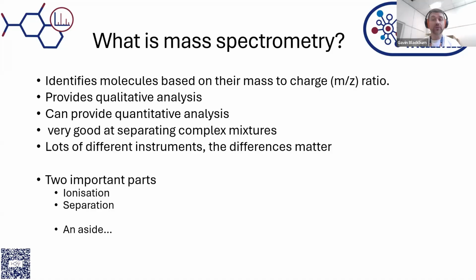The way we apply tools in my lab when we are doing omics-based mass spectrometry can make this very, very difficult. But if there are some very specific things people are interested in, you can design really highly accurate, highly robust quantitative methods to try and get that data out of it.